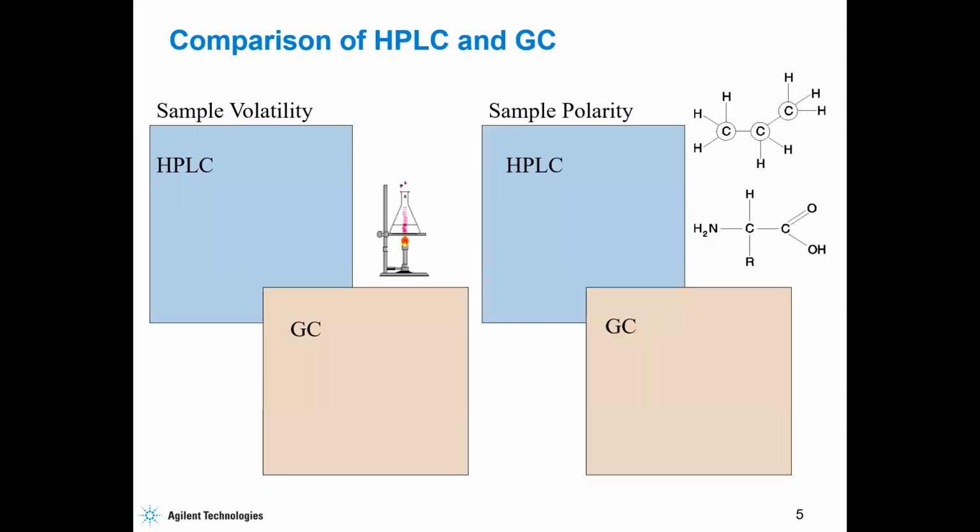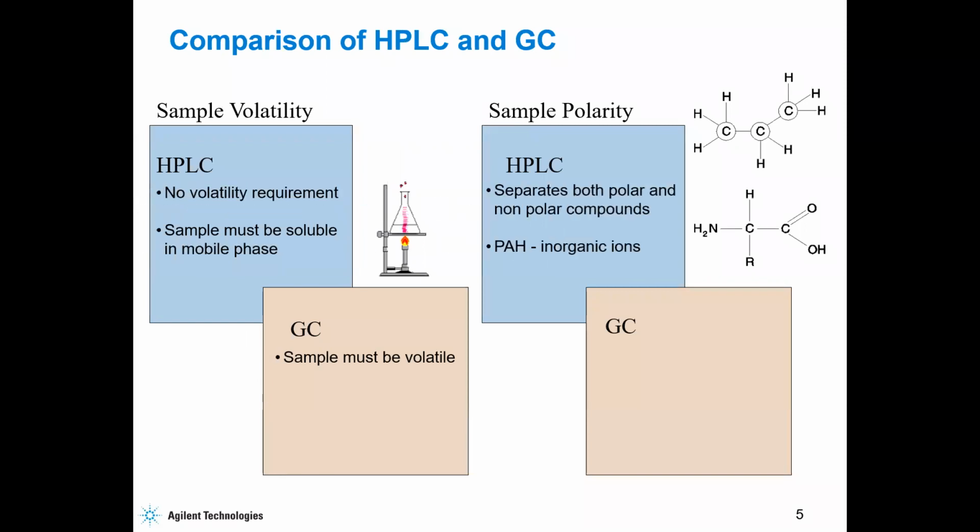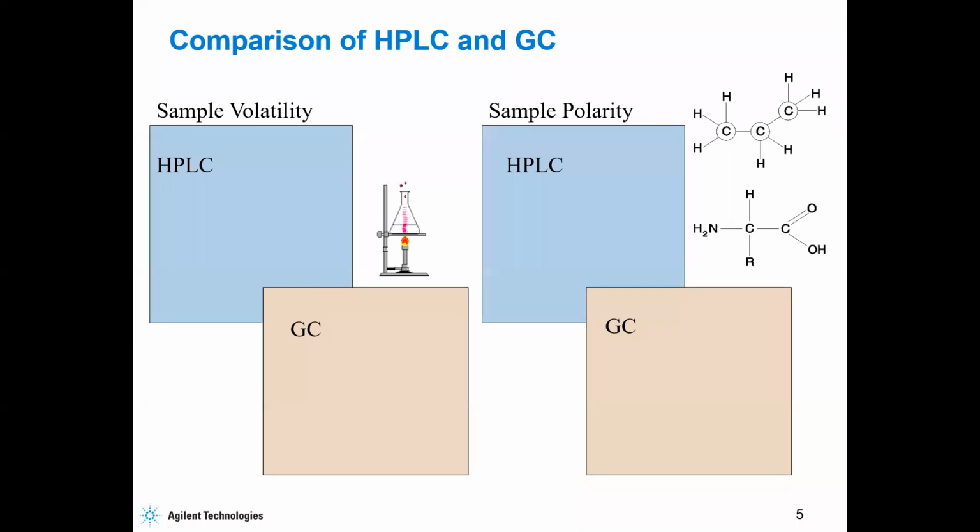Now, since there are so many variables that can be manipulated in all these chromatographic techniques, from GC, temperature, and so on, and since there are so many things that can even affect the retention time, is it possible for me to convert from one retention time to another, assuming I'm comparing two results from different laboratories, or even two different analysts, or even using two different conditions?